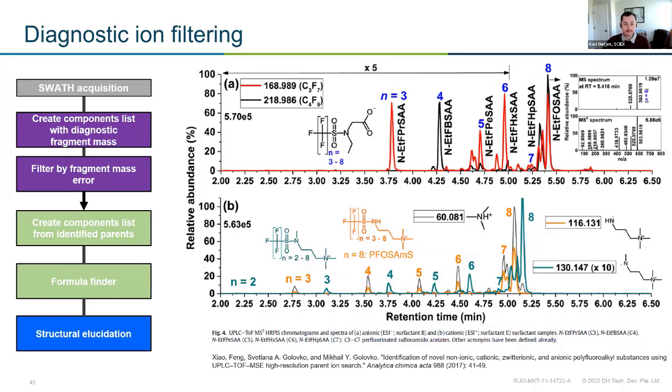And the retention time is different. So you would never know to look for that compound. But it was pretty successfully used to screen for new analogs of fentanyl because we can just look for that fragment. So we were looking for that diagnostic fragment that tells us that that backbone exists. And we can do the same thing in fluorinated analysis. So we're looking for specific fragments that are unique to PFAS compounds. Or maybe you want to get more specific and you want to prioritize things that have a sulfate group or amine compounds.